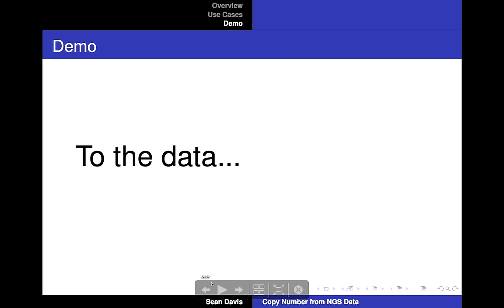There's a paper from Eric Lander, I believe, in 2009, I think it was in Nature Methods, comparing SNP array resolution, I think it was an Affymetrix SNP6 array, to about 14 million reads from shotgun sequencing basically of a sample, and the two were nearly equivalent.